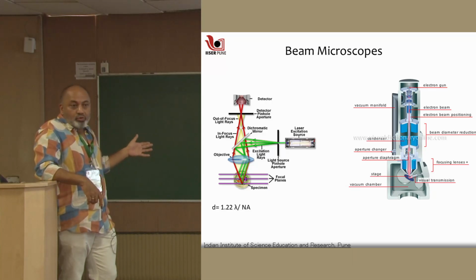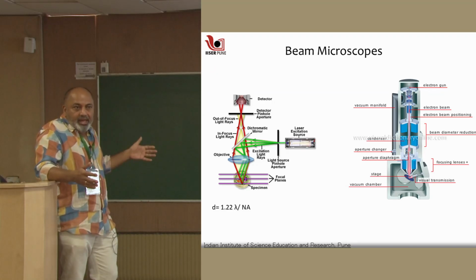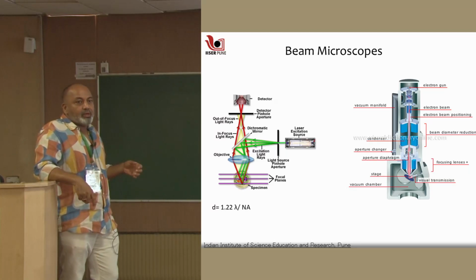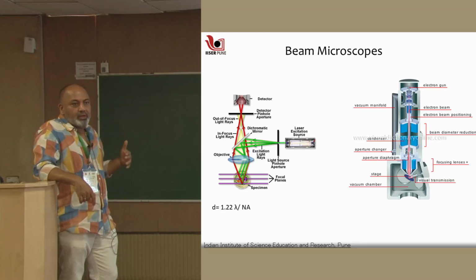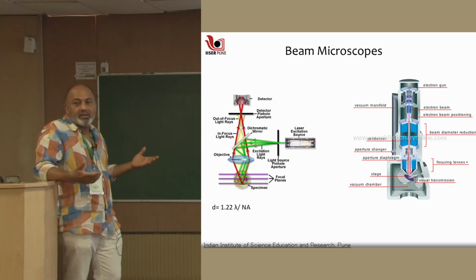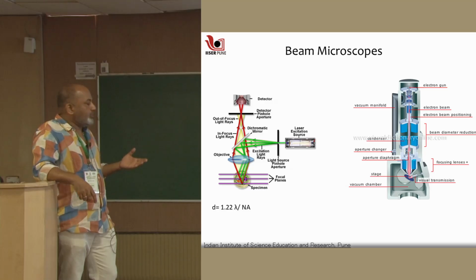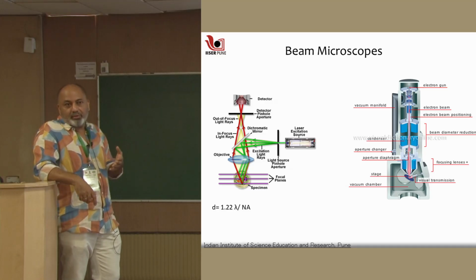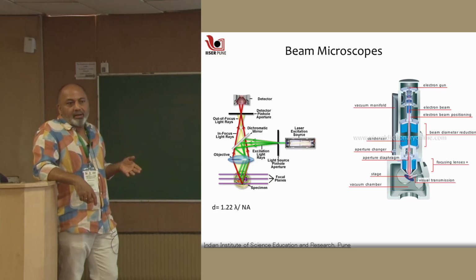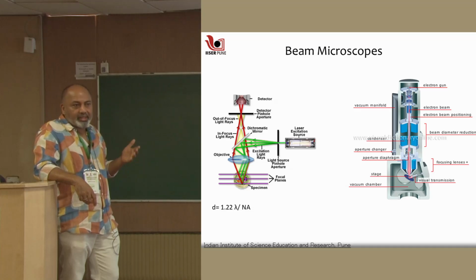For instance, you can use a numerical aperture which is very large, and you can make a lens that is maybe the size of this room, and astronomy people do that, but that is not really feasible for a tabletop microscopic experiment. So numerical aperture cannot be increased beyond a point. Typically we all know, if you are working in a biology lab or with microscopes in general, this is really limited to 1.3, 1.2, something like that.